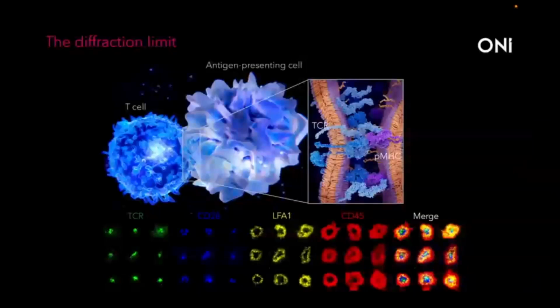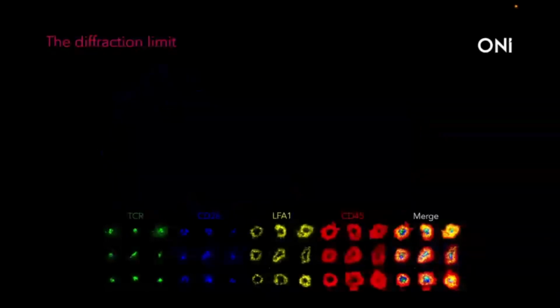And fluorescence imaging can tell you an awful lot about this structure. The understanding of the immune synapse has been instrumental in understanding how T cells get activated, as well as similar structures in other cell types. But the issue is that the actual molecular detail is happening down here on the nanometer scale. The TCR-MHC complex only has a lateral size of about 2 nanometers. And when you're talking about individual interaction events, which are biologically meaningful in immunology, the fact that you can't see these is problematic. So why can't we see them?